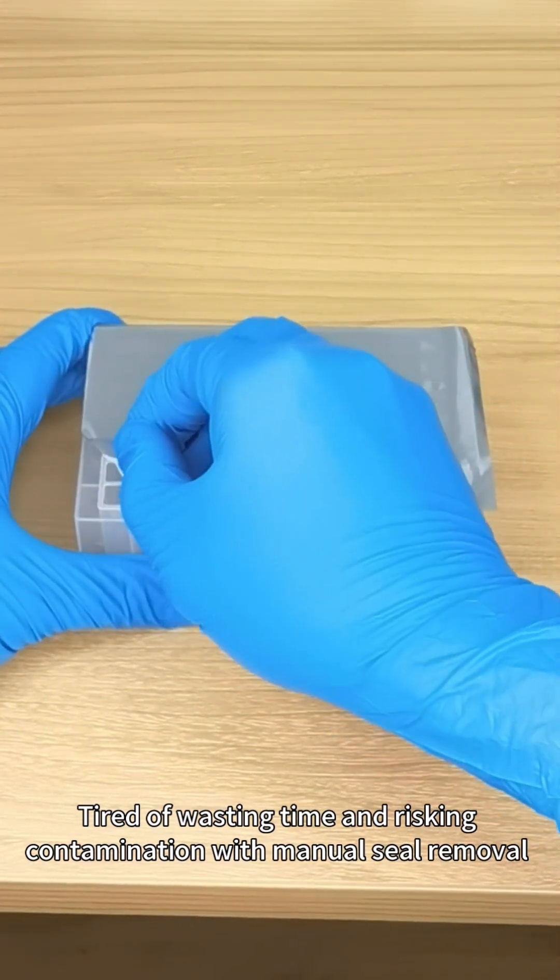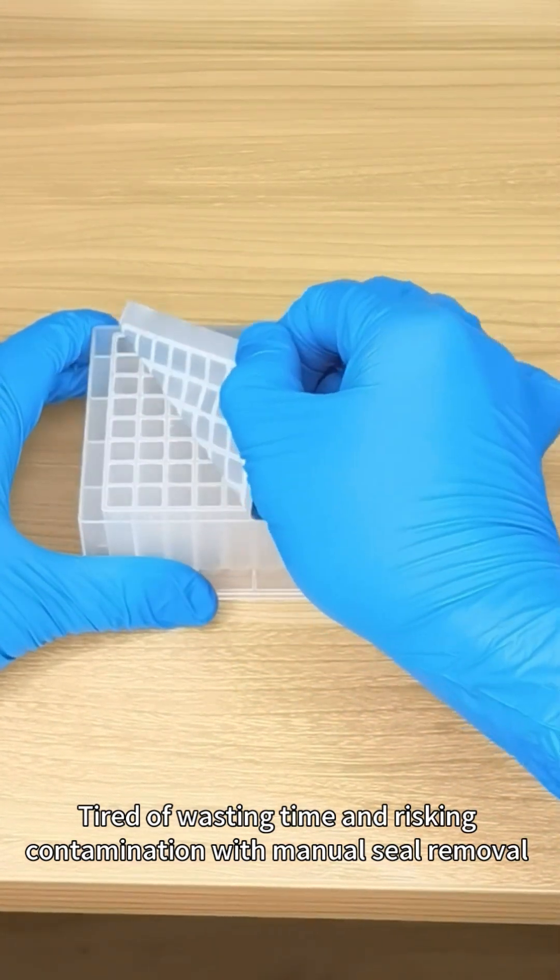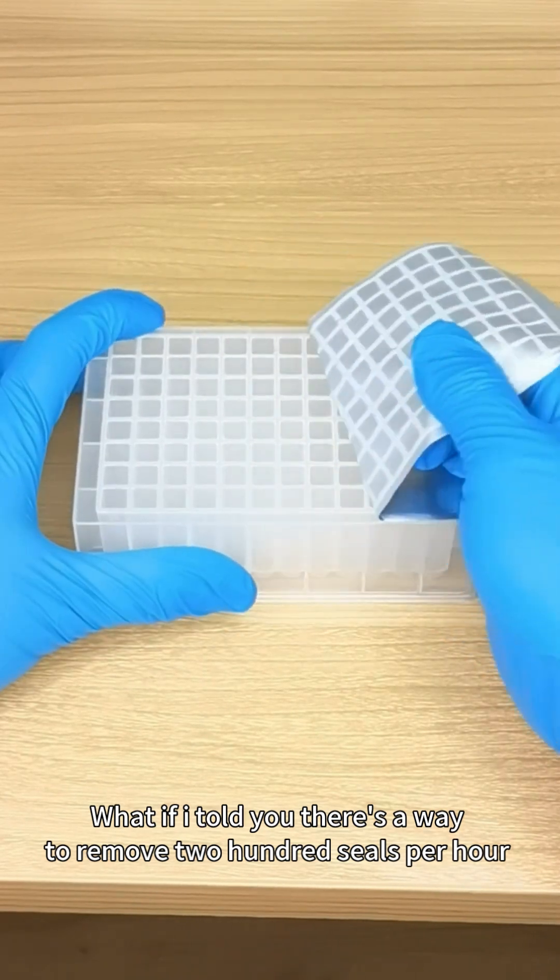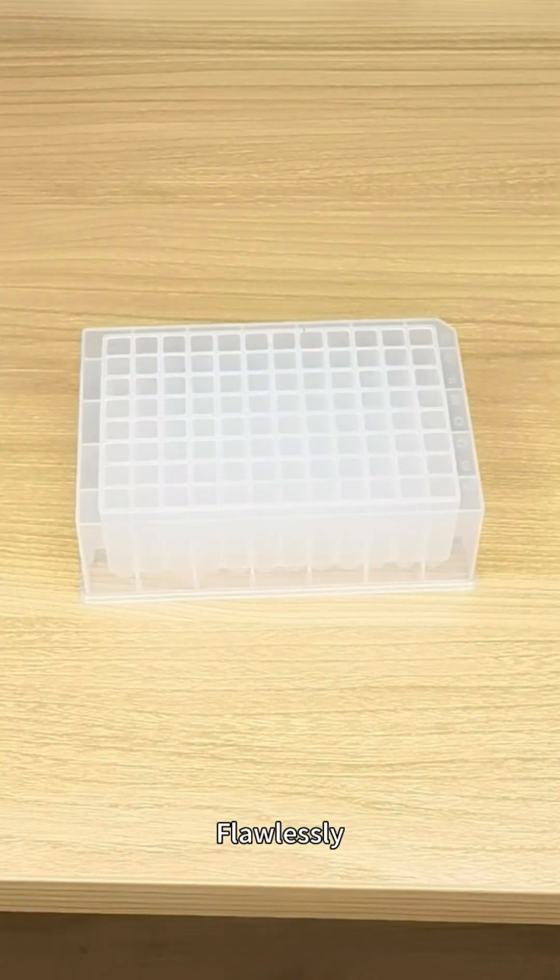Tired of wasting time and risking contamination with manual seal removal? What if I told you there's a way to remove 200 seals per hour, flawlessly?